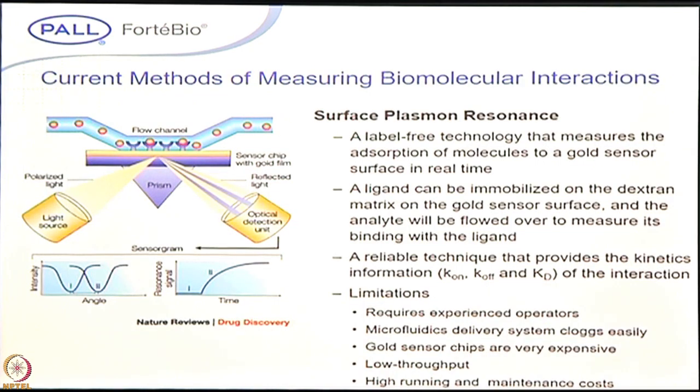SPR technologies are real-time label-free interaction systems, where on the gold chip you have a matrix, to which you coat one protein of interest, and then you pass the analyte through the fluidic system, and then you can see the interaction change with respect to the angle.